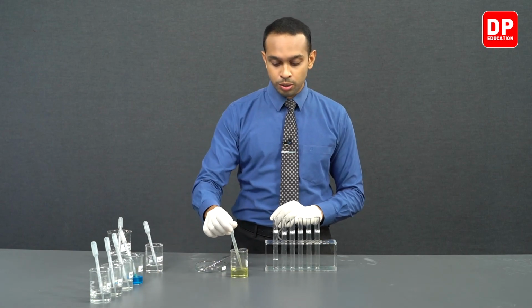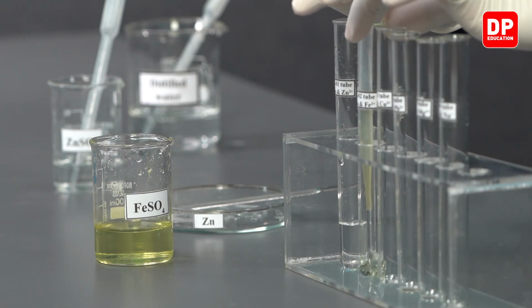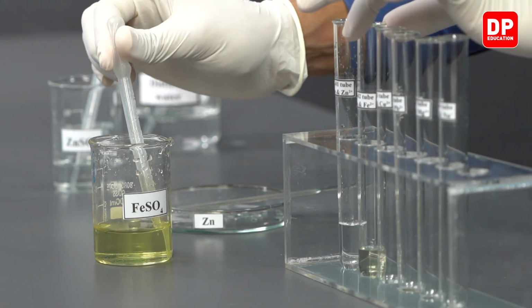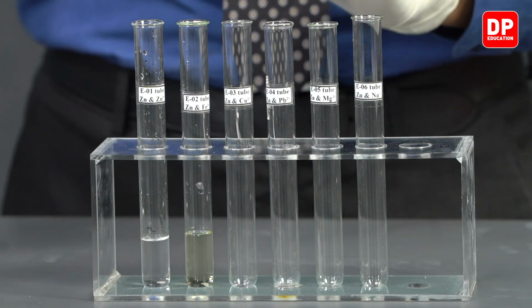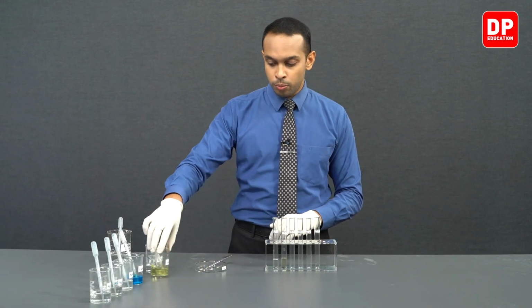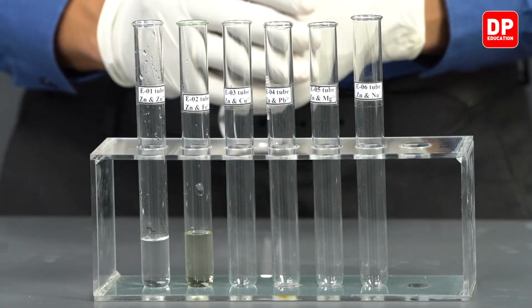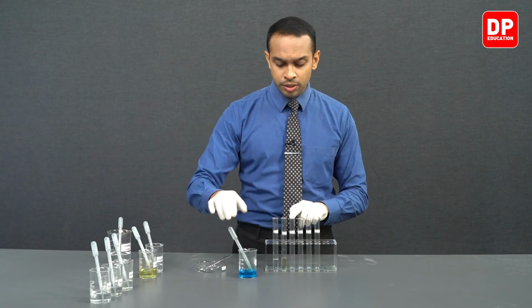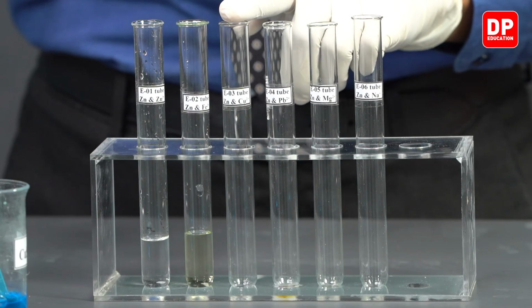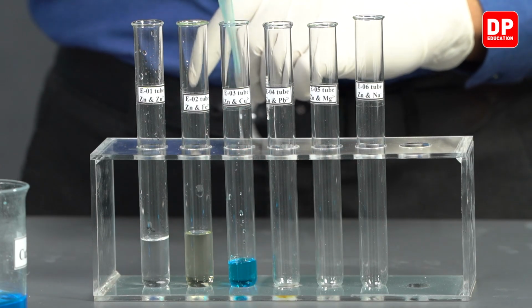And then we have a freshly prepared ferrous sulfate solution over here, and we will add this ferrous sulfate solution into our Fe2+ labeled test tube, or we can even call it the E2 test tube. And then to the E3 test tube, which is labeled Cu2+, we will add our copper sulfate solution.